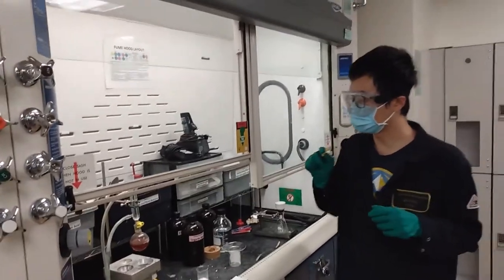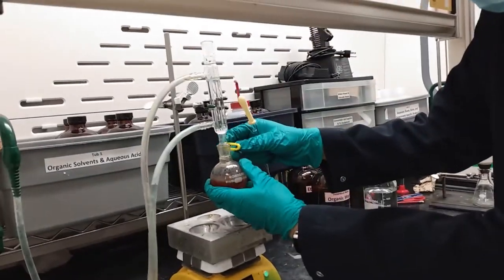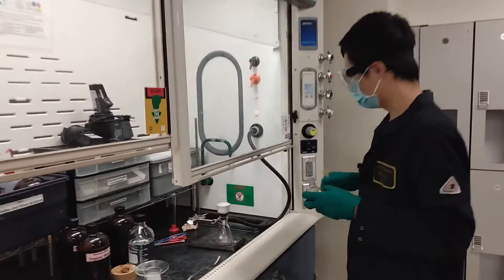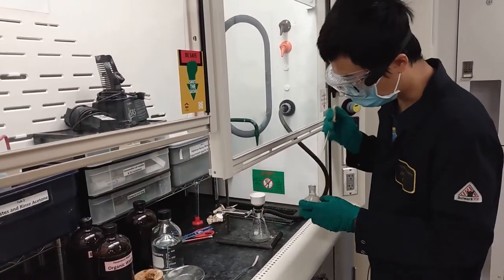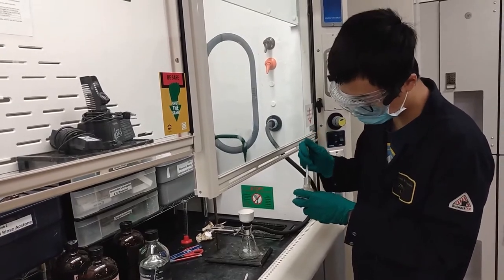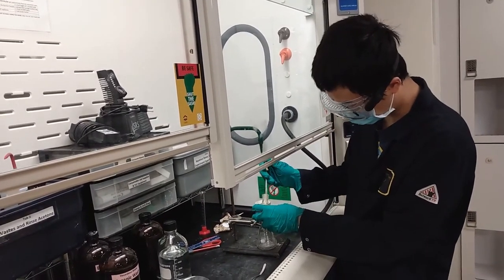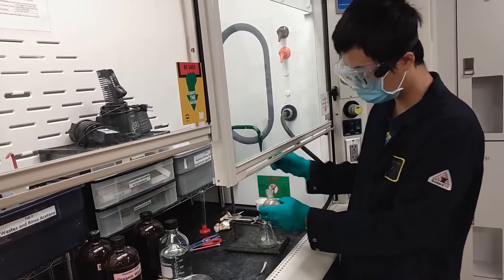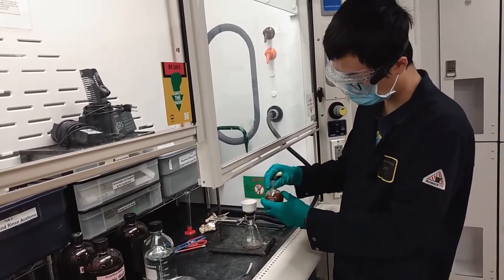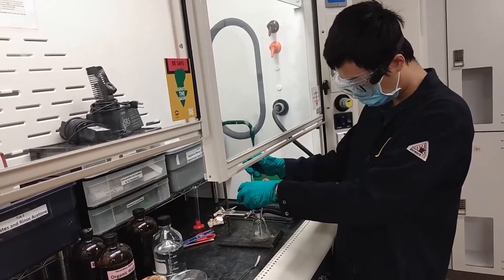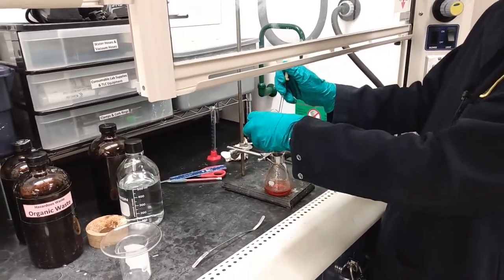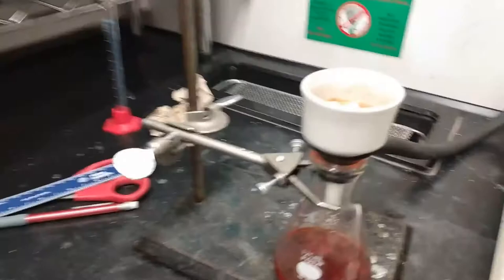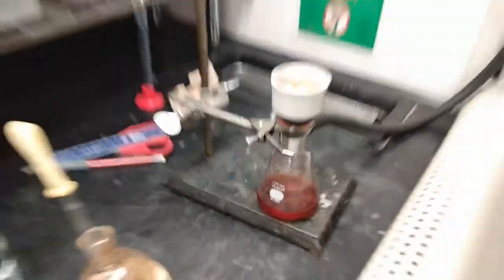All right, so now the refluxing is done and it's cooled to room temperature, so I can take it off and do vacuum filtration. This is the vacuum filtration setup. I've already put the filter paper in the Buchner funnel. Wet the filter paper a little bit before pouring it in. Shake it a little bit and pour it in gently. Now there's no more liquid dripping off from the bottom, so it's done.